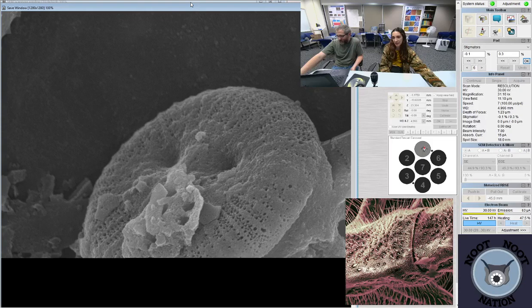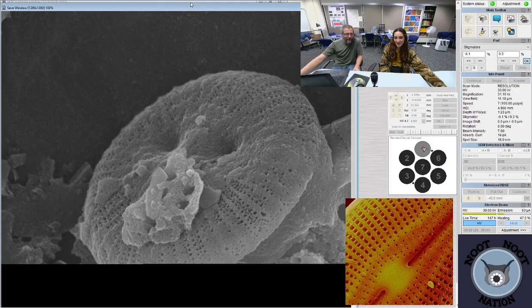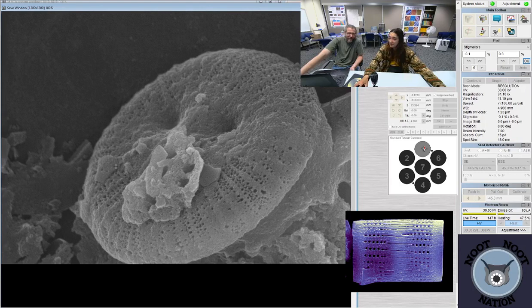Kvass Residue says, so many interesting shapes of these things. Yes, that's the way diatoms are. Charismatic, interesting shapes, never boring, especially in the light or scanning electron microscope. Especially this one. You don't see all of this on the light microscope. You can see some of it, shadows, but not the actual structure.